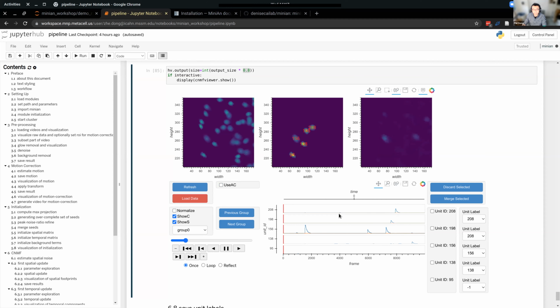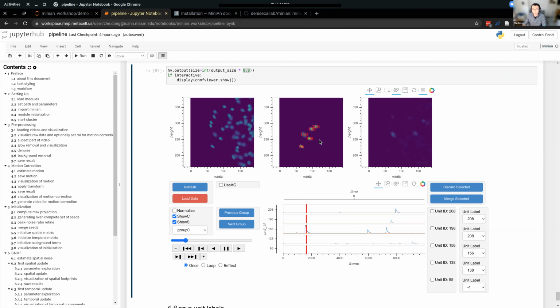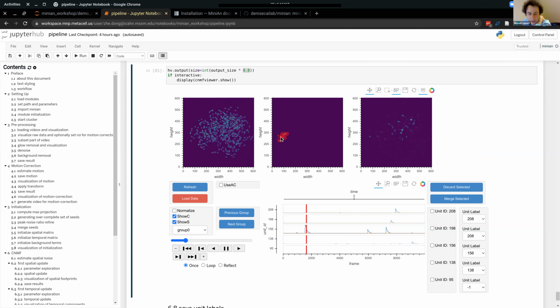Yeah, that's what's happening. If I uncheck it, it just makes the middle blue, and I only get a few units in what was previously the former box, and only the right panel looks good. You mean like this? What if you reset? Yeah, exactly like this.